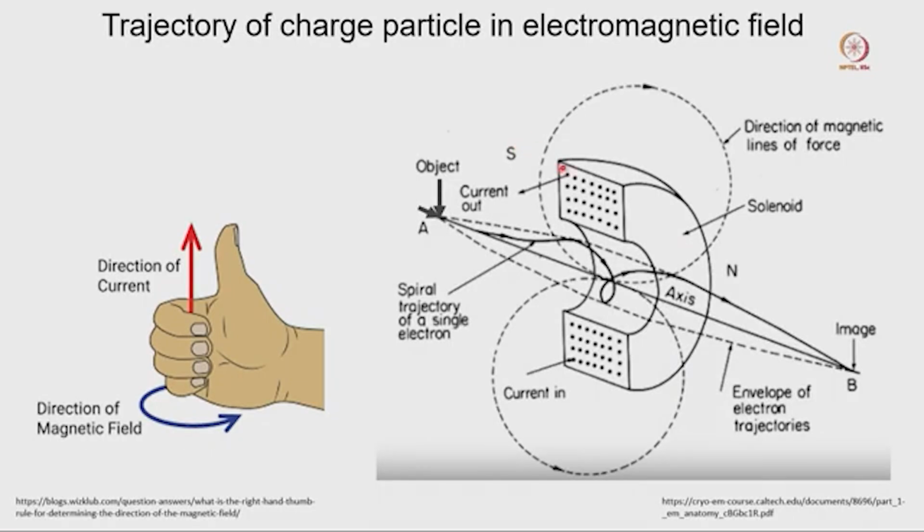So here this is the magnet that I discussed, and those are the copper wire which is wound up tightly, and now there is a magnetic field. One magnetic field is traveling in this direction and another magnetic field is traveling in this direction. Okay, and this is the right hand thumb rule that I already discussed.